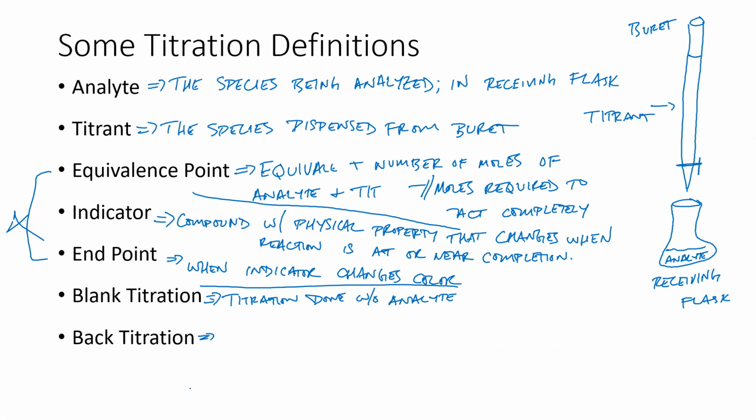All right, a back titration is a technique where you over titrate, you add excess titrant, on purpose, not by accident, right? And then you go in and you use a standardized solution to go back to the endpoint.